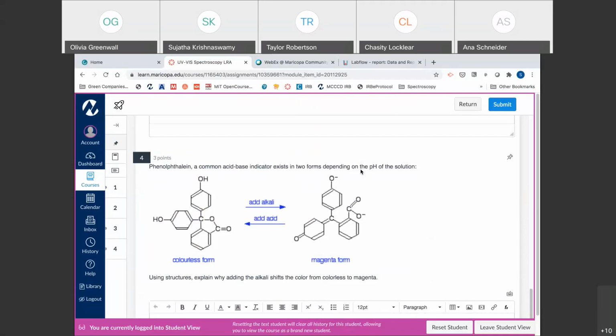Okay, so phenolphthalein, a very familiar compound to you guys coming from Gen Chem. It's an acid-base indicator. It's colorless in acid medium, and you know your endpoint is pretty dramatic. With one drop, you get a bright pink color. Okay, so this particular compound is colorless in acid medium, but in the base medium, it takes on a very bright color. So when there's sufficient amount of base, what happens is the base comes, now you know more chemistry. It can pull out the hydrogen from these alcohols and make them O minus, and then it takes on this form. Okay, and there's a little bit of reaction as well.